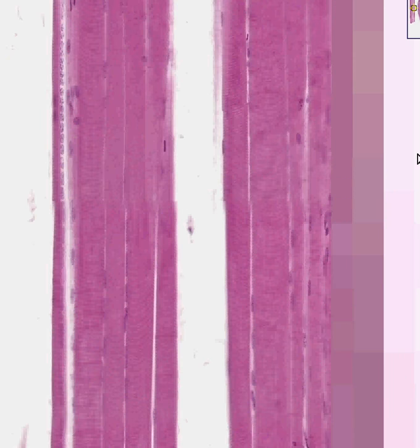Technically, if you cut one of these nuclei tangentially with respect to the fiber, it might look like it was in the middle of the fiber, but in reality, that's just a geometric artifact. In true voluntary skeletal striated muscle, the nuclei are all at the periphery. You could identify the striations better from doing longitudinal cuts with respect to the axis of the fiber. You could identify where the nuclei are better by doing cross or axial sections. This is classical striated skeletal muscle.